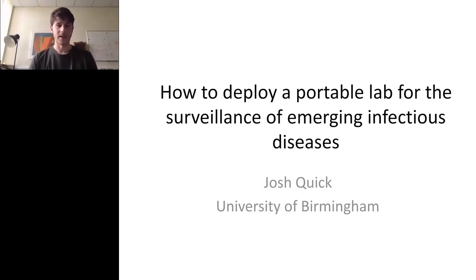So the Oxford Nanopore MinION technology is very interesting because it's allowed, among other things, the first truly portable genome sequencing to be performed, and it's really opened up this whole new area of field sequencing.